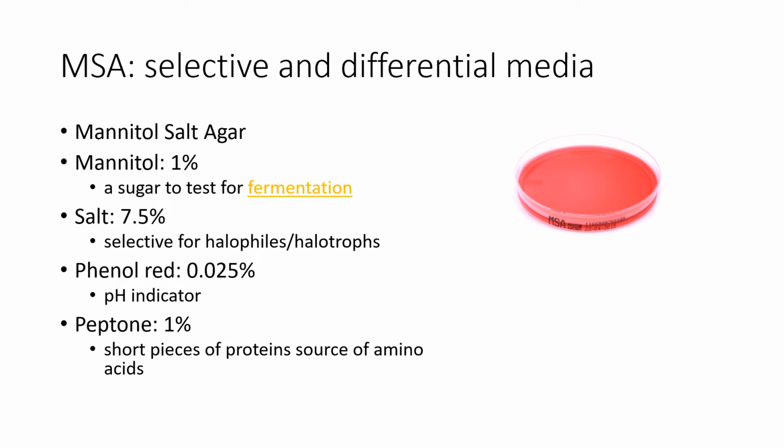But, okay, the agar is not edible. What else is there to eat? There's sugar and there's peptone, and that's it. There's no lipids, there's no other sugar, there's no nucleic acids, there's not a bunch of yeast extract and beef extract. This is it. So this is chemically defined, really specific. Okay.